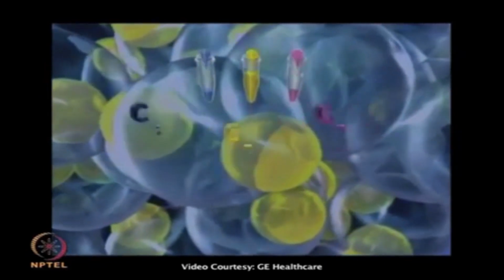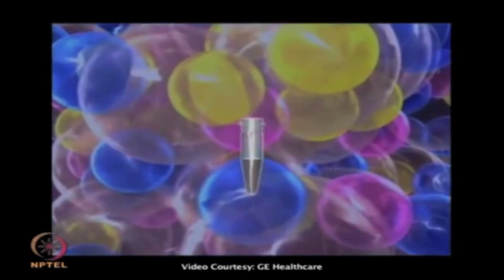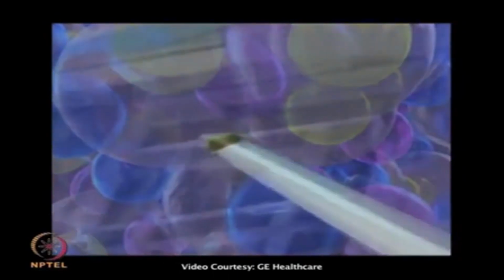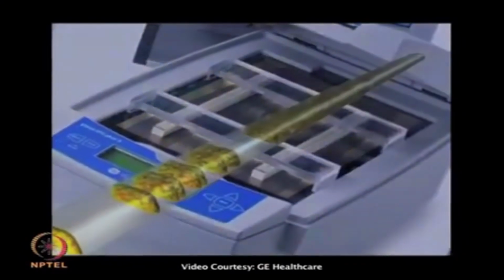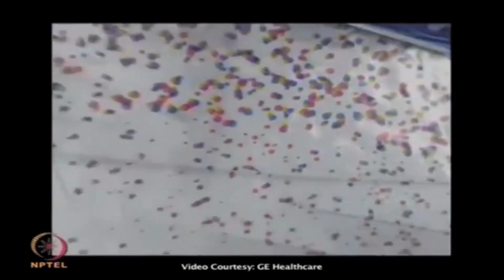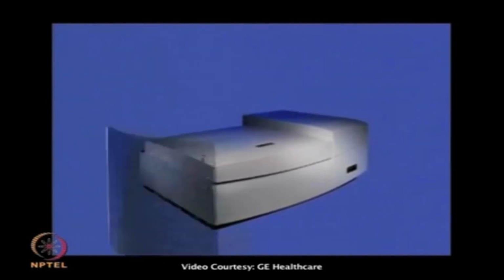Then you mix those three into a single tube and run them in a single strip. There they are analyzed in the first dimension, the IEF, and after IEF you place the strip into the second dimension. Now this gel can be scanned in the Typhoon Trio Plus, where you will have three images from a single gel.